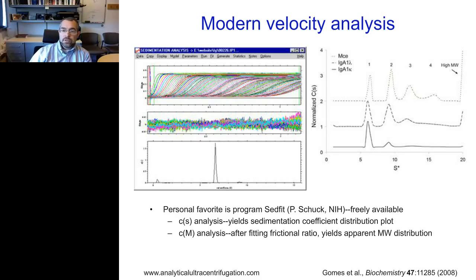And then way over here, we see the really massive stuff, and this is generally aggregate or potentially a circulating immune complex, something really massive that is so large that the program basically says, yeah, it's even bigger than what we're currently looking at.